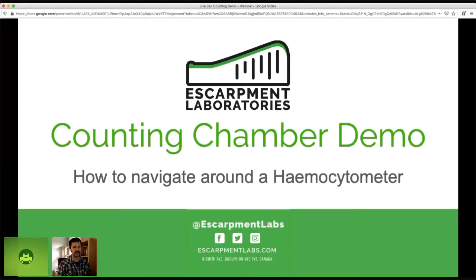So, a counting chamber demo. I've already loaded stuff onto the chamber, and I'll show you how to navigate around.